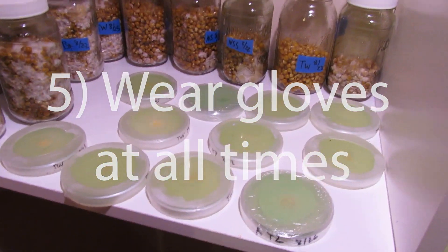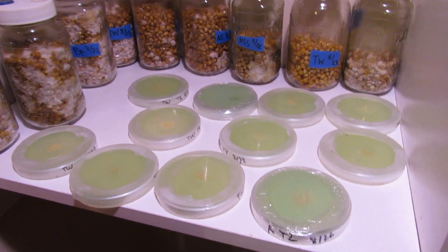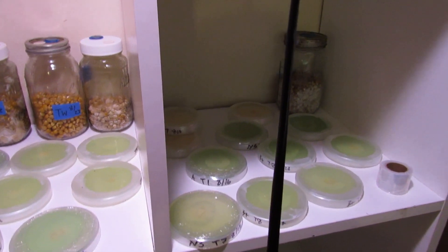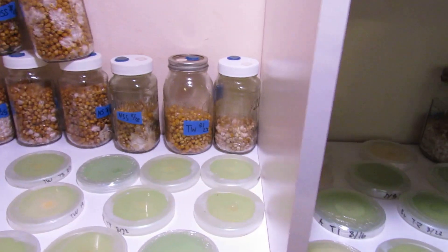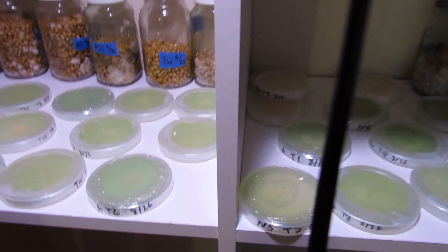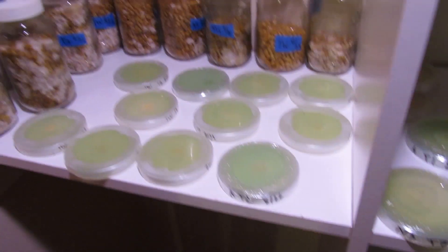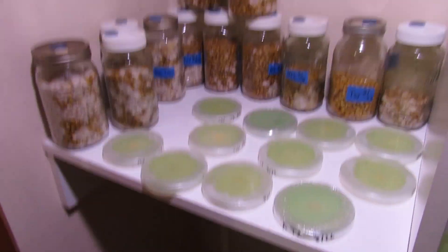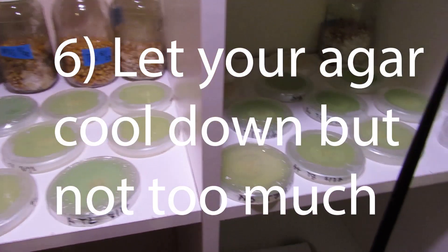Number five: wear gloves at all times, from when you pour your first plate till you wrap the last one. Keep spritzing your hands with rubbing alcohol. I tried just rubbing alcohol on my hands without gloves and you'll be lucky if two out of every 12 plates survive. Wearing gloves definitely helped a lot.